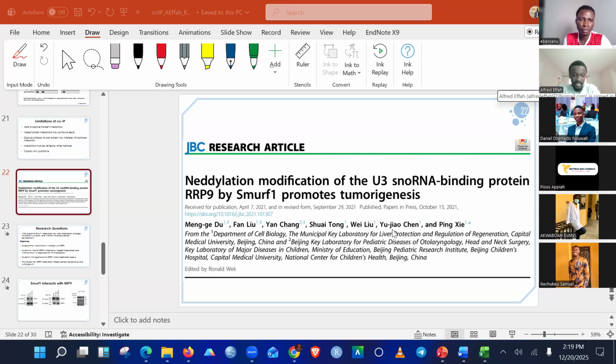So basically, let's say I suspect two proteins to be interacting, or let's say you were just staining some samples and you saw that there are these two proteins. When you perform your immunohistochemistry, they are always together. So that was immunohistochemistry. The tissue is now out. It has been processed. Now you've stained and you are seeing all of them together. Now, if they are together, it raises some sort of suspicion. Why are they always together?